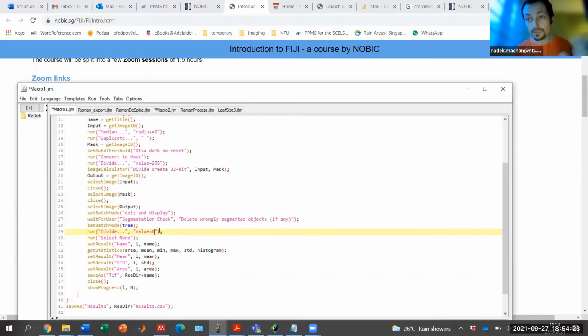That will work because dividing by 0 doesn't make sense. So if I divide 0 by 0, it will give me something which is called not a number. Let's try.